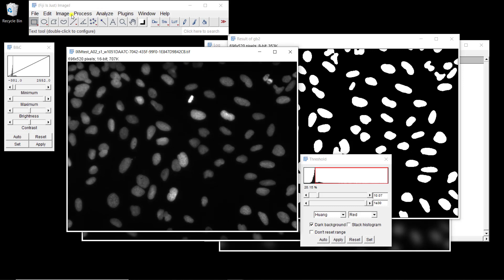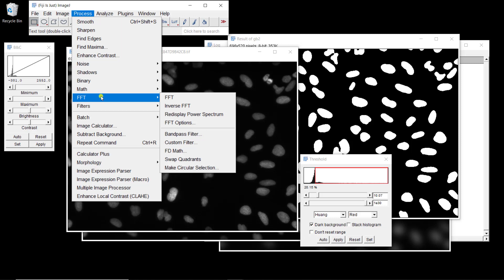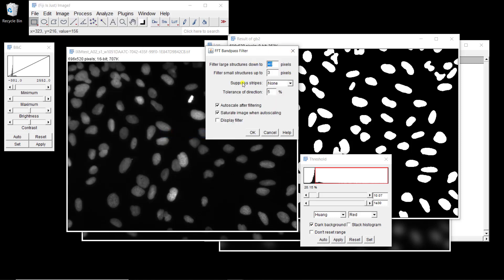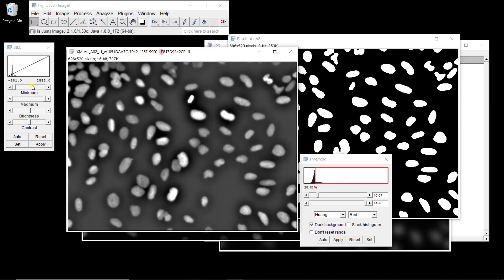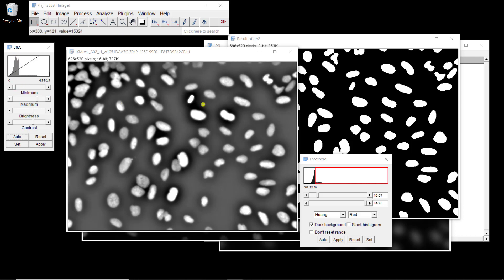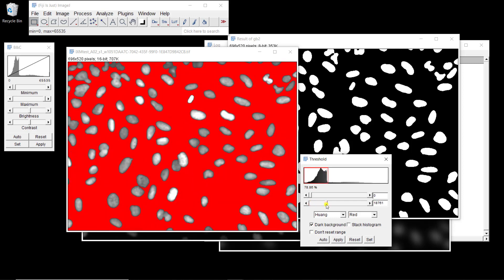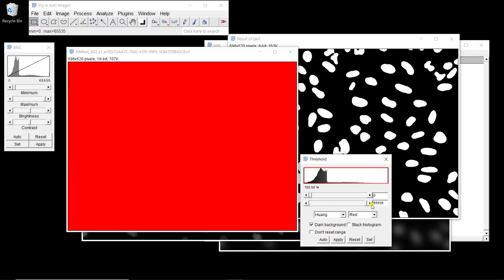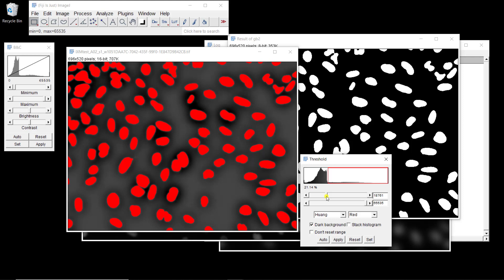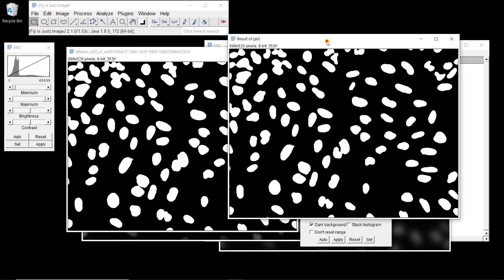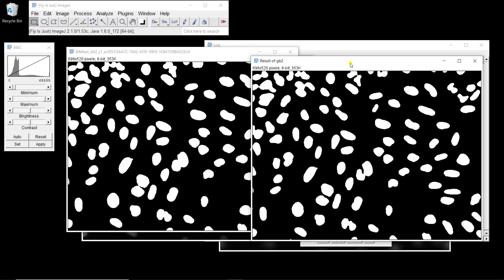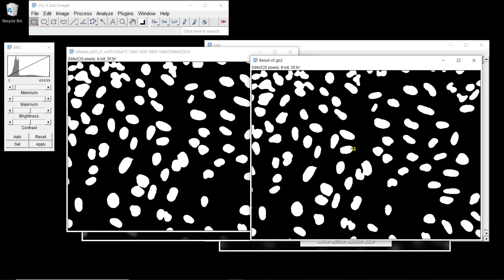We could also use a bandpass filter with an FFT: Process > FFT > Bandpass Filter, using the default parameters. That's the result — it's pretty neat as well. When you look at the histogram again, we have a huge peak, so if we threshold right after the peak, that looks pretty nice too, though we have some spurious pixels. Comparing those two results, they are pretty similar — not exactly the same, but fairly similar.